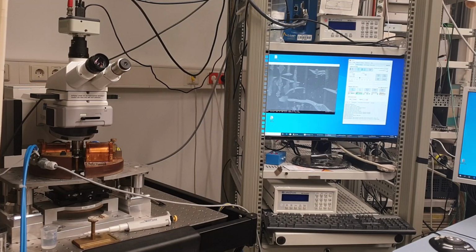And for example, if we apply a field in one direction, then the magnetic domains which are magnetized in the same direction will grow, while the others will disappear. And the same is also true for the reversed way.